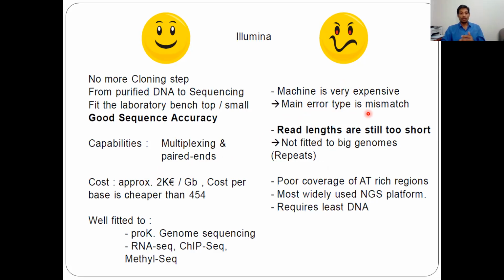That means if your target genome or gene is, let's say, 10,000 bases, your sequencing is not just fitted to the 10,000. You have to have multiple small fragments so that each nucleotide is overlapped multiple times, so that you can reduce the mismatches.